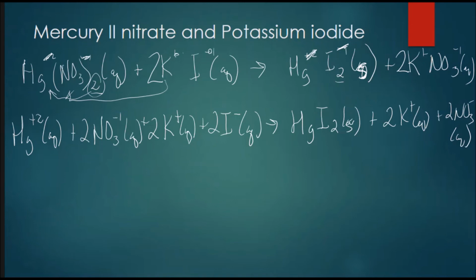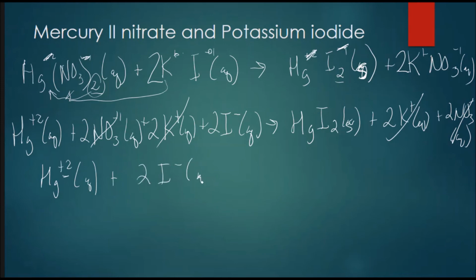And of course, we should have two ions that are exactly the same on both sides that didn't do anything. So, chlorides, bromides, iodides are soluble, but there's a secret I'm going to tell. Working in a lab, it's plain to see they're insoluble with silver, lead, and Mercury I. But in this case, it's Mercury II, as you can tell. Mercury II also forms a solid.